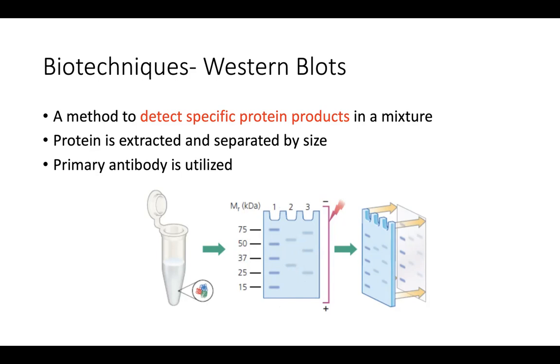I mean, it's used for disease diagnosis, you name it. This is a very frequently utilized technique in microbiology, cell biology, pretty much across many different disciplines. No matter what your area of specialty is, the Western blot is a critical tool in your lab, right? Again, because protein function is one of the hallmarks of cellular activity, genetic analysis. We're looking at proteins. These are functional products in our cells. So biotech does not exist without the use of the Western blot, all right? Jot that down. I will ask you questions later about the Western blot technique.